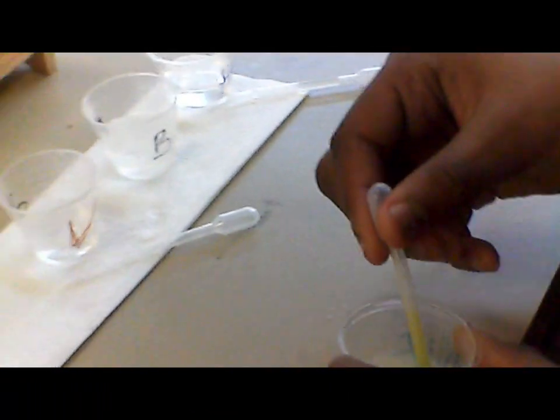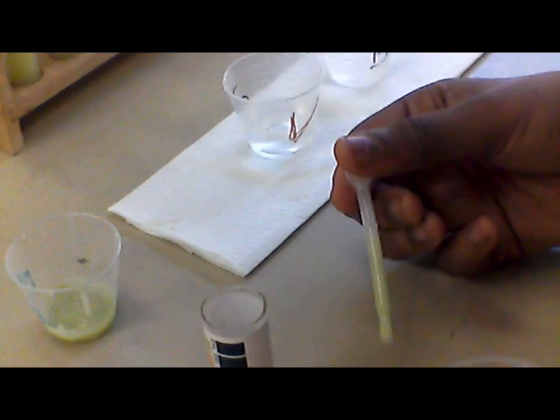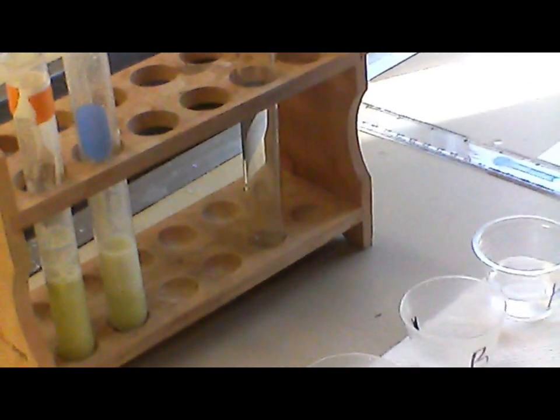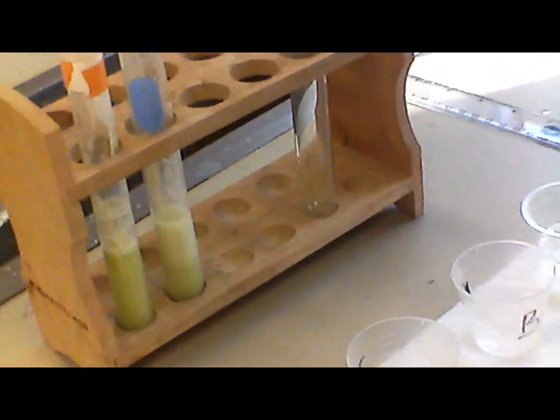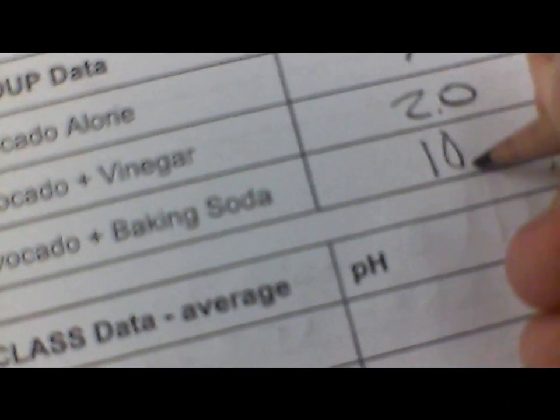Alright, get a strip. I only have one for you. Just a little drop. Alright, that's like a dark green. Alright, and then what is it? It's like a 9. 9, 10. Yeah, 9.0. I was gonna put a 10.